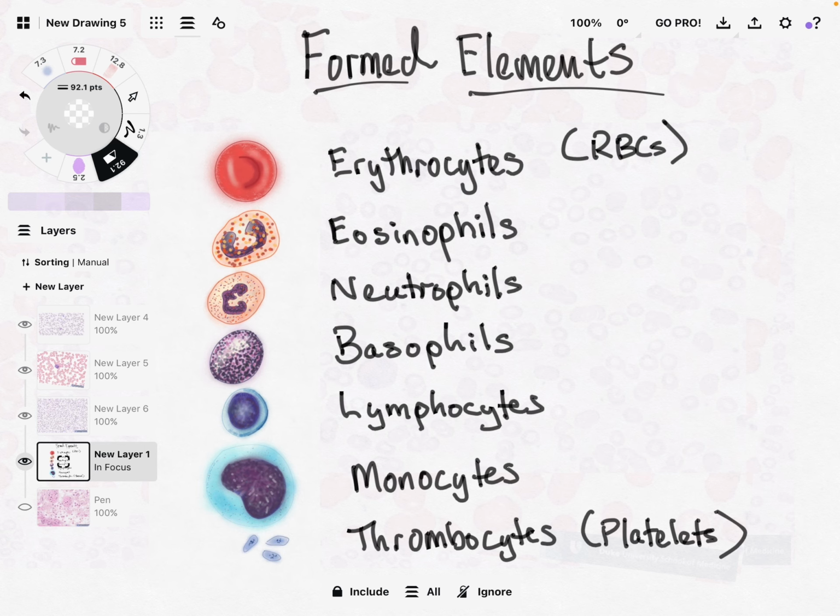And this is why H&E is so good, particularly just in general staining processes of cells, because here you can differentiate the nucleus from the cytoplasm, or even in some cases, more specific cells like an erythrocyte that doesn't have a nucleus, so therefore it doesn't have any basophilic or hematoxylin stain components. It stains obviously red or pinkish, versus something like a basophil that has lots of these secretory vesicles that stain particularly dark with the hematoxylin. So with our formed elements, we can actually differentiate based off of this very common, very basic H&E stain. So it is very good to distinguish between these different cells.